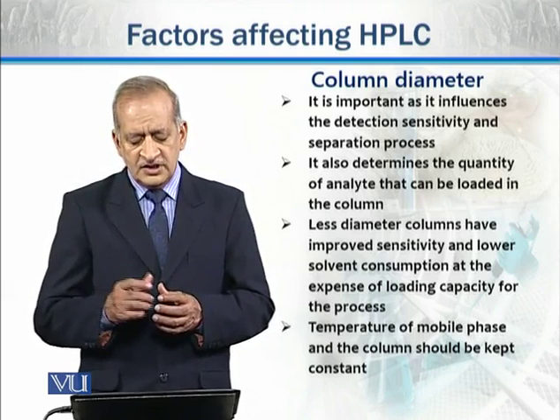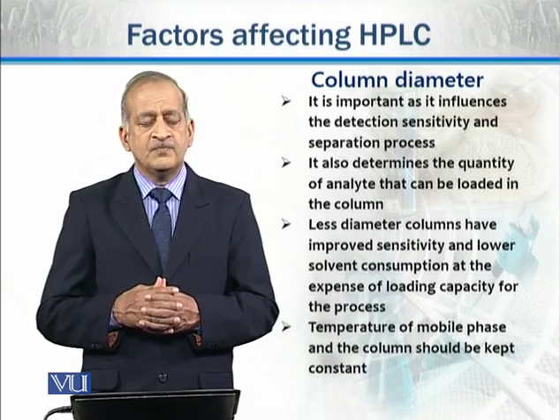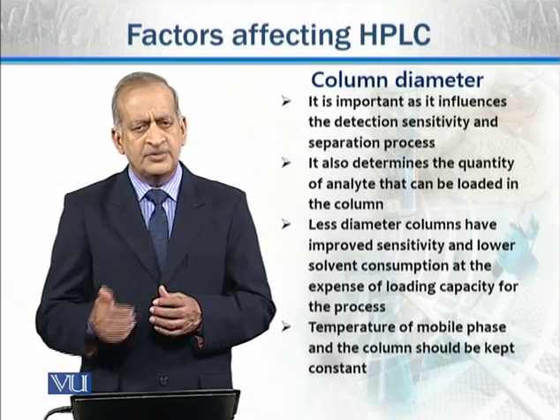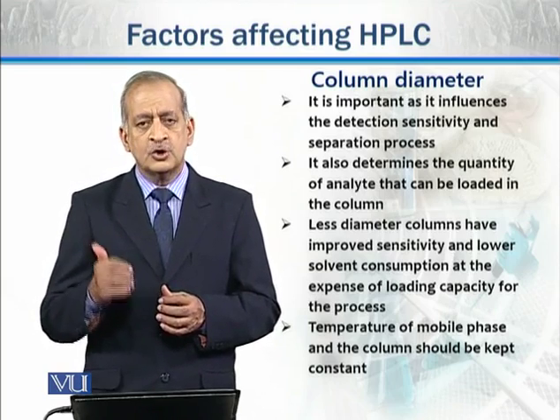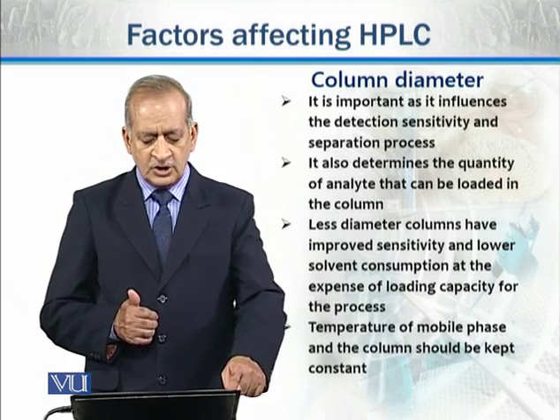So generally, less diameter columns have improved sensitivity and lower solvent consumption, so they are preferred as compared with the columns which have more diameter. So this is column diameter.